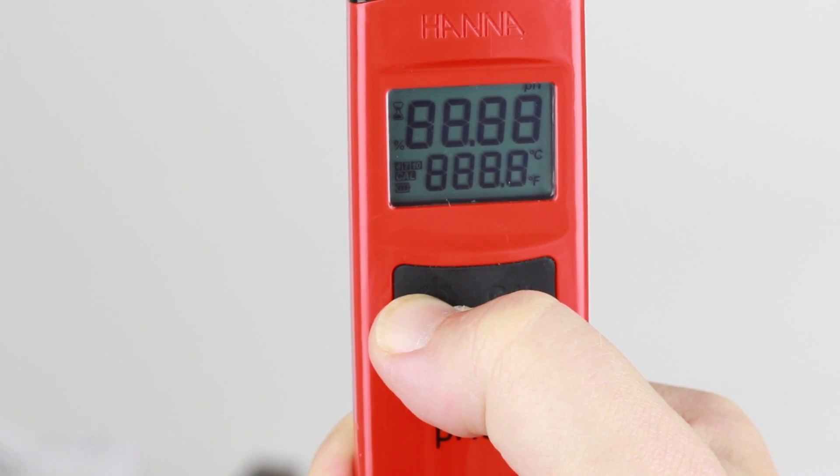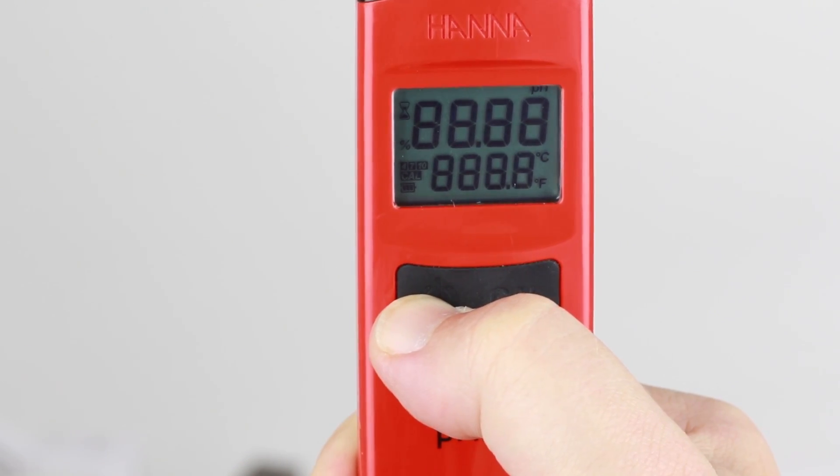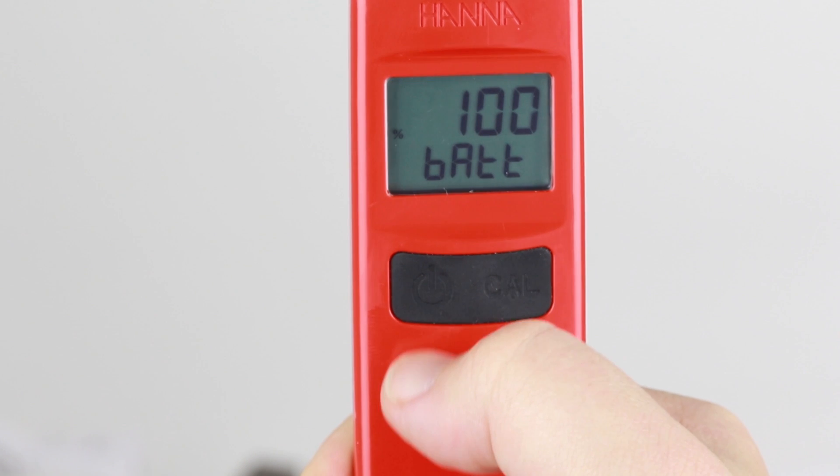To operate the meters, simply press the left on-off button to turn on. All the LCD segments are displayed, then the battery percent level, notifying the user of the remaining battery life.